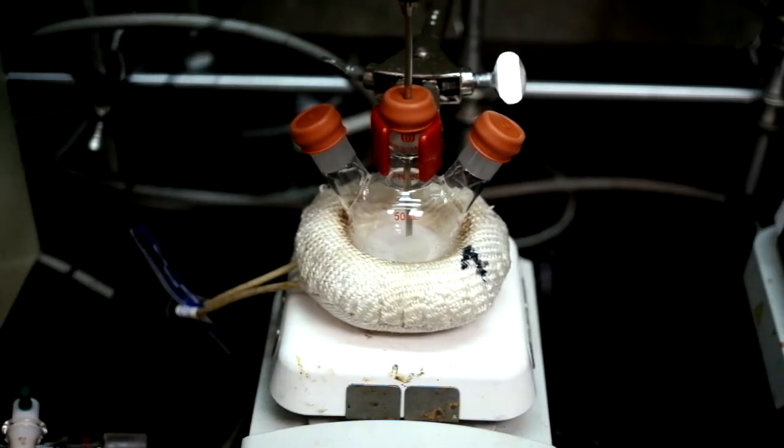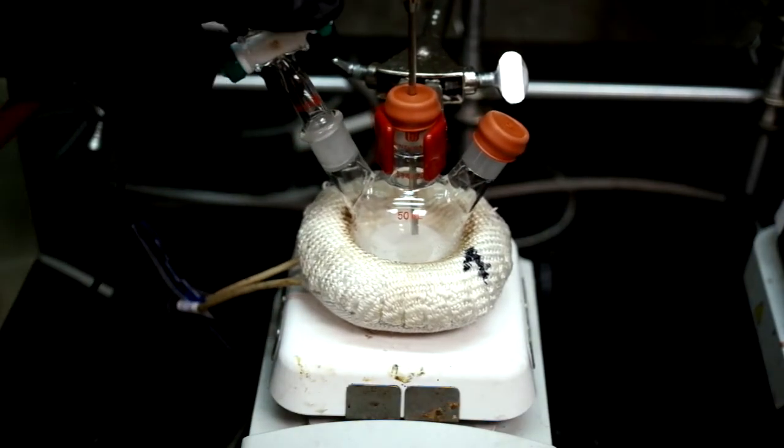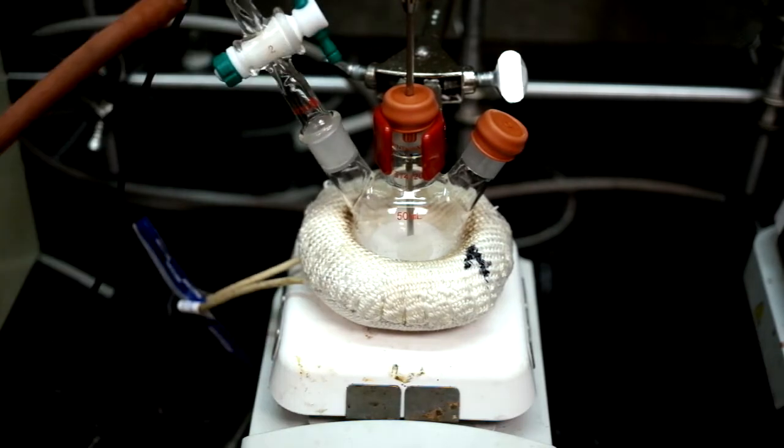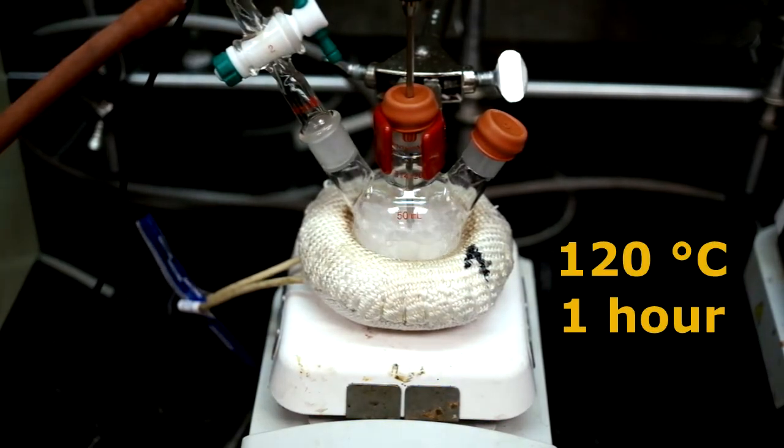For each of the three flasks, we insert a temperature probe, turn on the magnetic stir bar, and place under vacuum for one hour at 120 degrees Celsius.